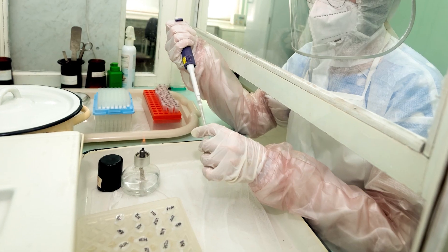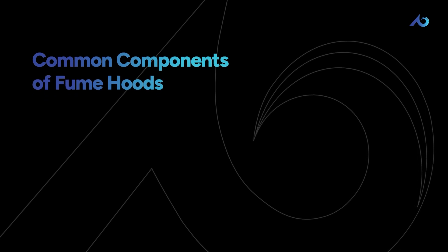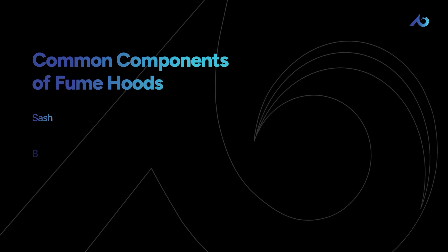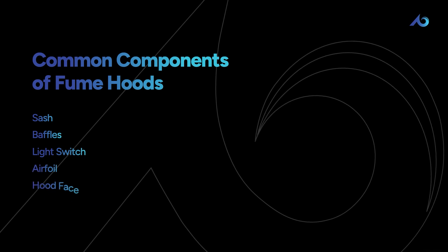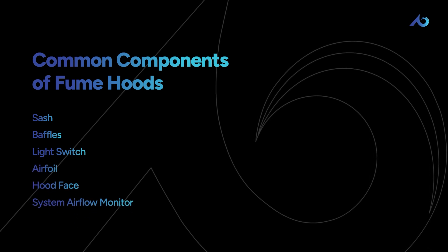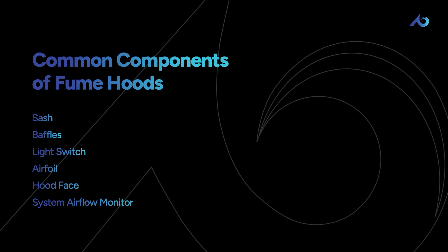While individual fume hoods are specialized for different functions, they do possess similar components. They are all made of sashes, baffles, light switches, airfoils, hood faces, and system airflow monitors. Similarly, these components perform the same function across all the different types of fume hoods.